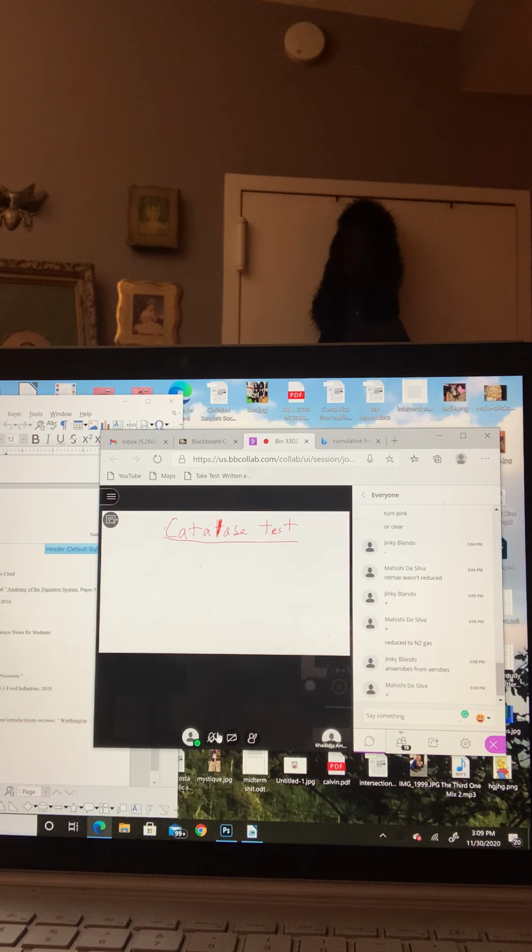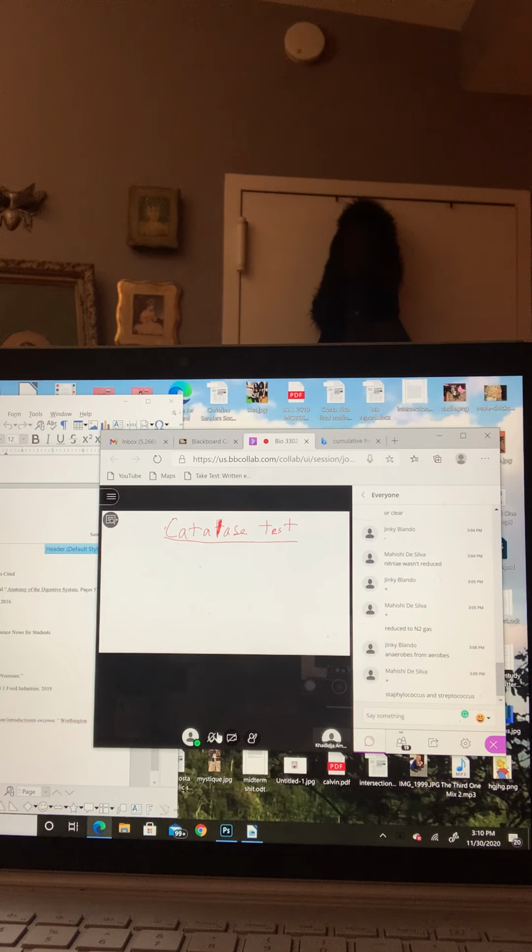And also the catalase test is used to differentiate which type of bacteria we talked about just before, and I will give you a question in your test or in your exam. So to differentiate what? Yes, please. The Staphylococcus and the Streptococcus. Good.